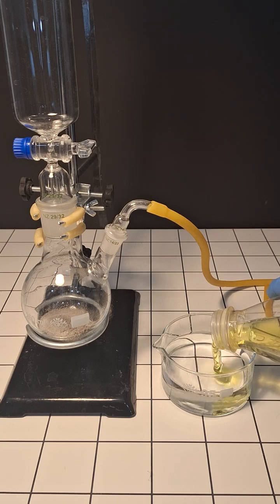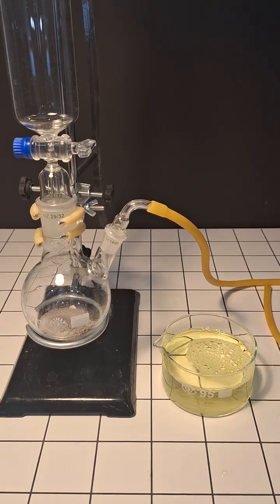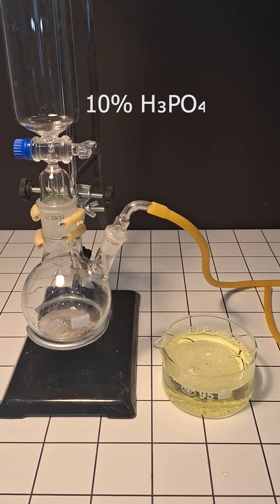Next we're gonna take a bowl of water and add some dish soap to it. On top of that we're also gonna add in a little bit of glycerin. Now we'll pour some 10% phosphoric acid into the addition funnel.